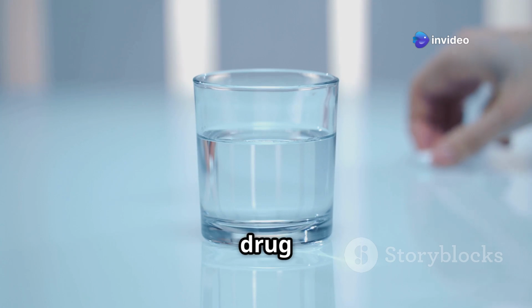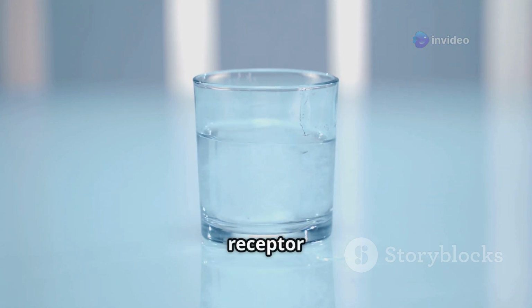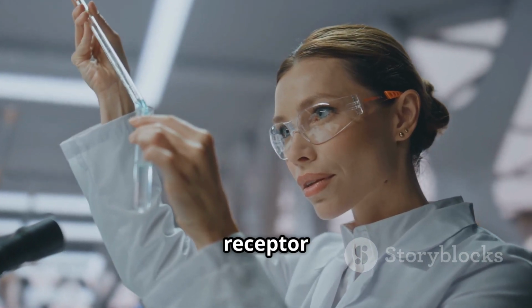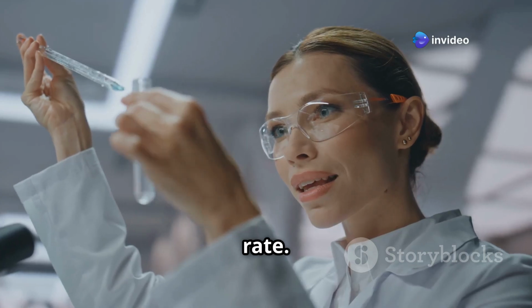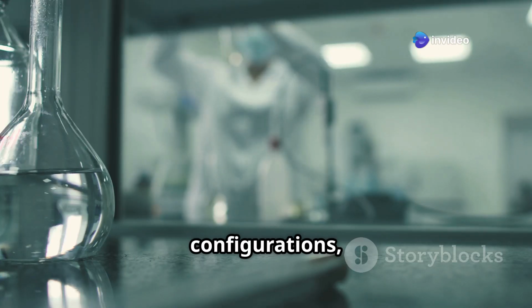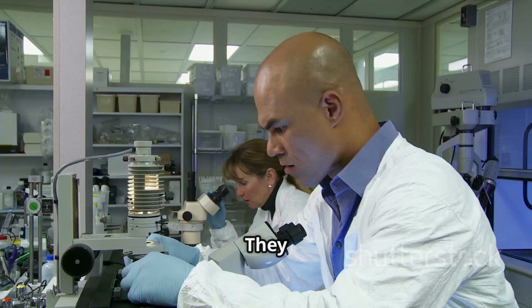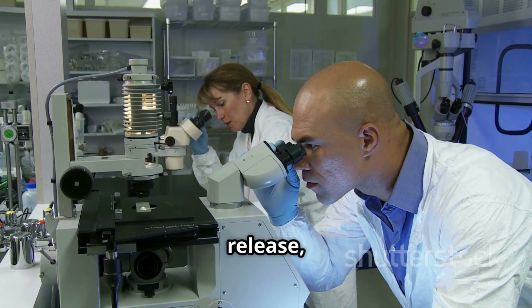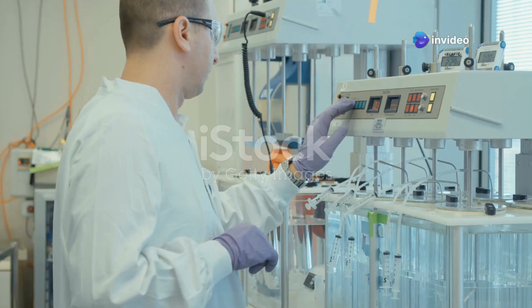Over time, the drug is released from the dosage form and diffuses across the membrane into the receptor media. We can then analyze samples taken from the receptor compartment at specific time points to determine the drug's release rate. Franz diffusion cells come in various sizes and configurations, allowing researchers to tailor the setup to their specific needs. They provide a controlled and reproducible environment for studying drug release, making them indispensable tools in pharmaceutical development.